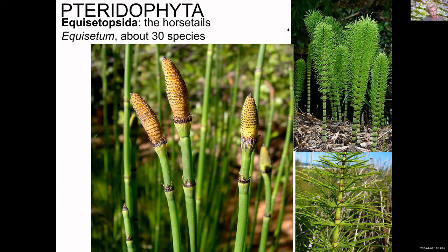All right. And these are the horsetails. Yes, I know. Sorry. Horsetails kind of look like horsetails. There's not a lot of diversity in their visual structure. Again, they kind of look like maybe asparagus. They're sticking up, and then they have maybe some kind of frilly stuff. If they do have a reproductive structure, it's a cone-like thing that's sticking up.